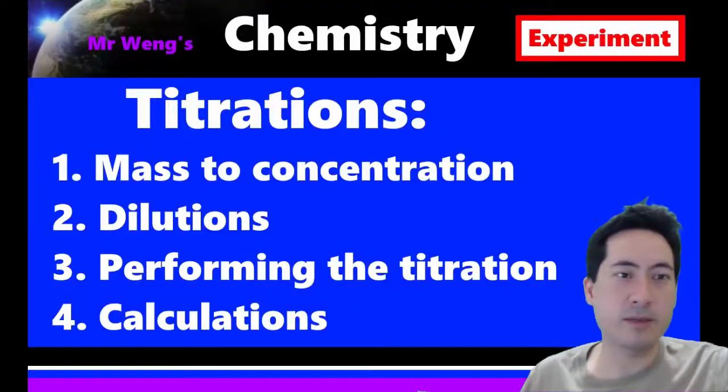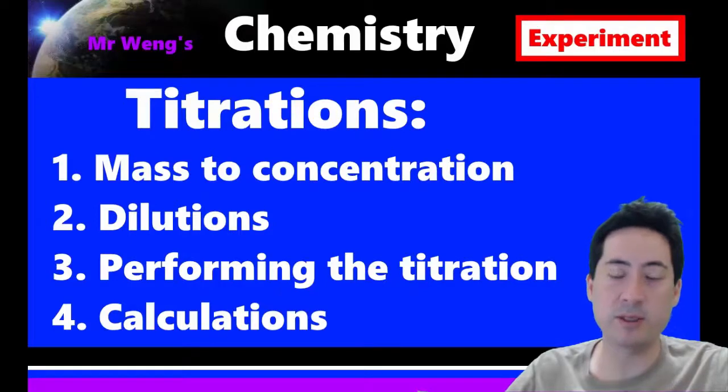So now that you know how to make dilutions, please go on to video number 3 on the technicalities of how to perform the actual titration.